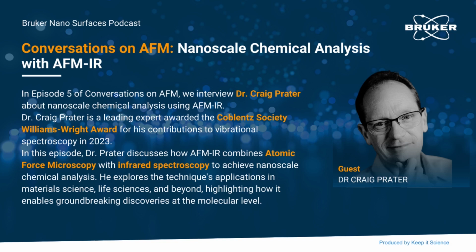And so there are great examples in the literature of people combining the chemical information from AFM-IR with the other multimodal information from the other techniques that I mentioned. And it's also very common for people to combine various other forms of analyses, for example, fluorescence optical microscopy or Raman spectroscopy, and people even combine with X-ray diffraction and in some cases mass spectrometry. And so all of these provide us more information, insight about the samples that we're studying.